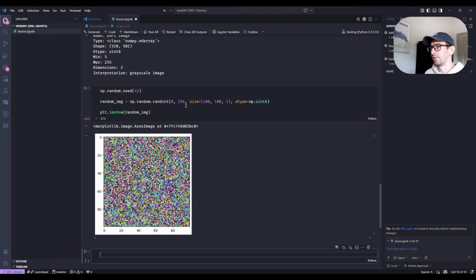Then you can check a histogram, but you don't see how it structurally changes the underlying data. Here you can right away use plot imshow and check what was before and what you got after. In this case, it's easier to learn some techniques. You can read about them and then apply them to the images, and you will right away get a representation of what happened after your tools were applied to the image.